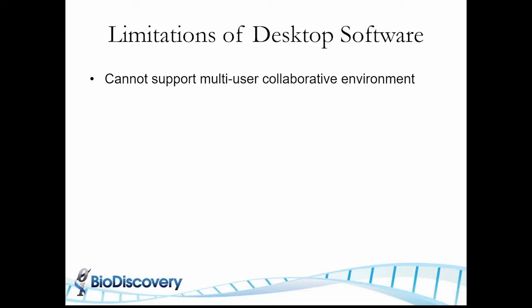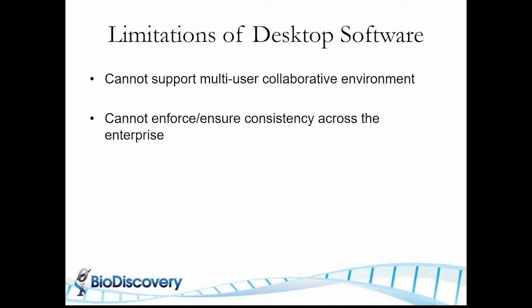You're not using the same information or even the same version of the software. If you make notes on some sample that you've reviewed, it's on your desktop. You can't share it. You have to copy a bed file, for example, to someone else. So it's really limiting in a multi-user workflow.